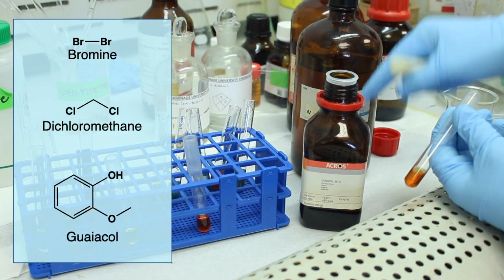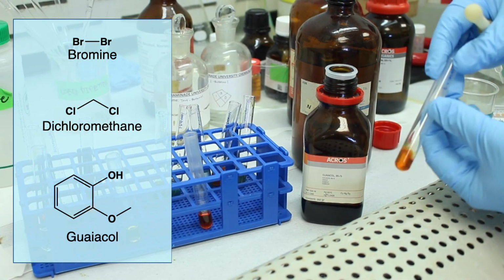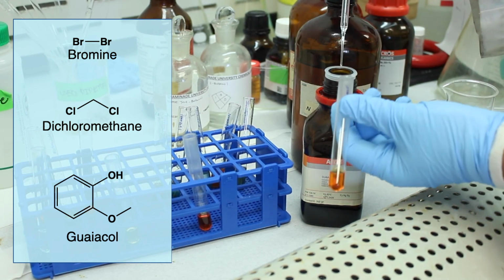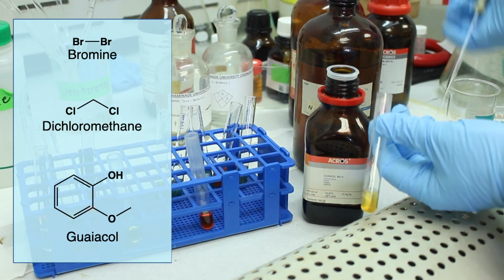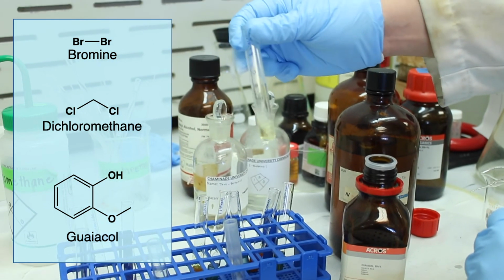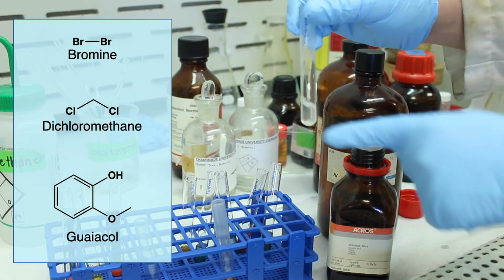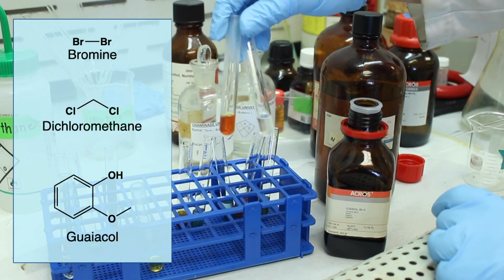By the way, the OH and the methoxy group are electron donating, so they make this ring more nucleophilic. So the reaction should go very quickly. So take a little bit of our guaiacol. It smells rather nice. Put some in the test tube. Place that there. And there you go. You can see that almost immediately the color has vanished. So almost all the bromine was consumed. There's perhaps a tinge of yellow in here, but clearly you can see it's a positive test result.